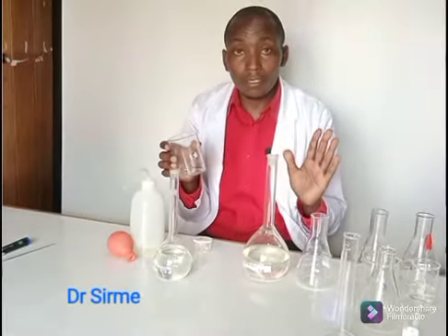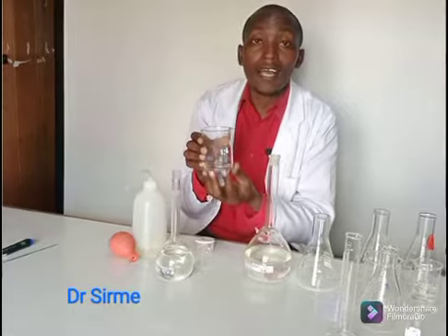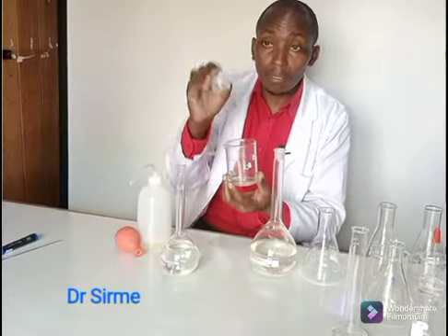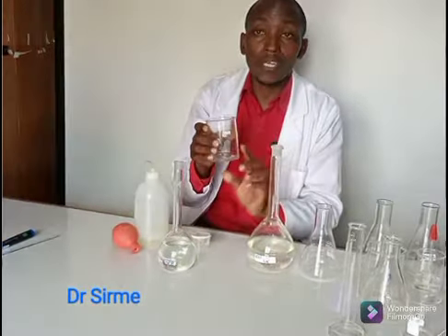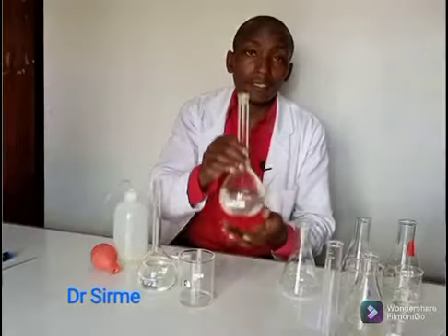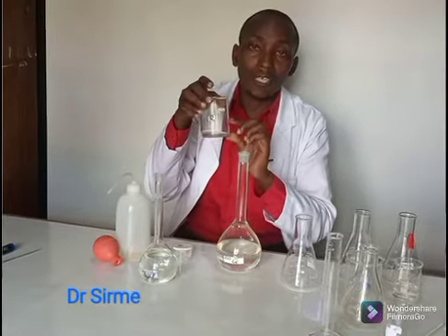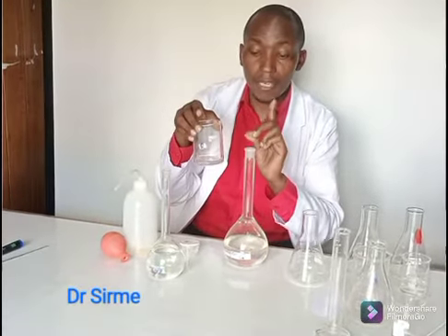And as we do titration in this case, we are trying to analyze the amount of hydrochloric acid that remained unreacted. If I can also just bring to your attention the impurity, remember this was impure calcium carbonate, the impurities did not react. So only the carbonate reacted. Having done that, I used a standard sodium hydroxide solution to help me determine the amount of acid that did not react in this beaker, or rather in the mixture that I have made here.